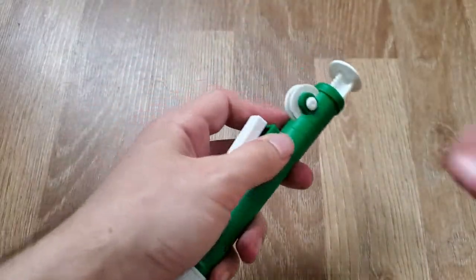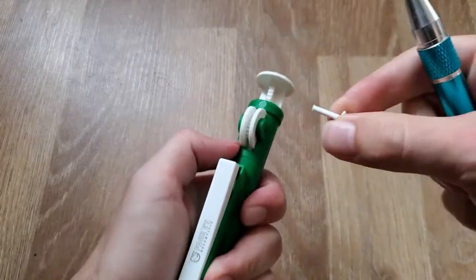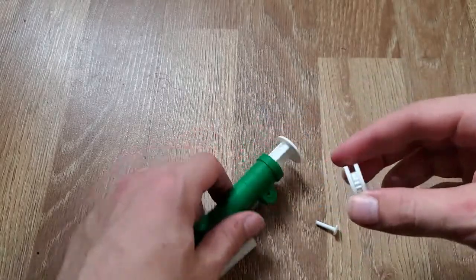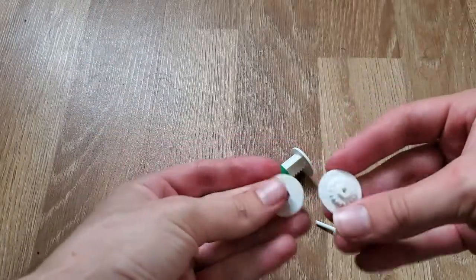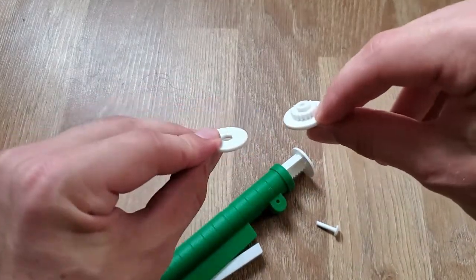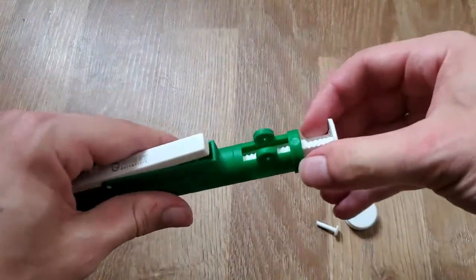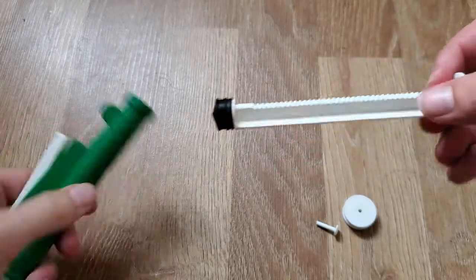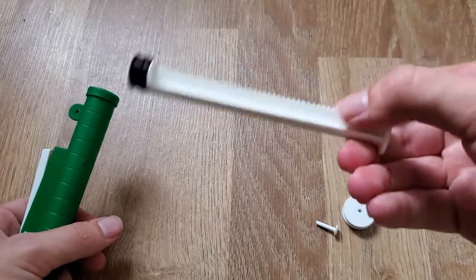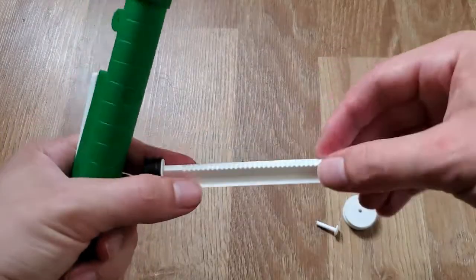To take it apart, I start by getting this pin out. Once the pin is out, this wheel comes right off — it's actually two pieces, which makes it even easier to recreate with a 3D print. You can then pull out this part, which is the syringe, basically like you would see in any syringe, but this one has gears on it so you can control it more precisely.